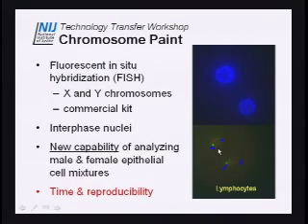Those are lymphocytes. They stain quite easily. This was done a little over a week ago. It's not a hard procedure. My daughter did it. That was the first time she'd ever done it. It came right up first time. Really nice, good stain. Now, lymphocytes are pretty easy. I have to say that. And these weren't necessarily forensic type samples, but it shows you what is the optimum that you can look at.